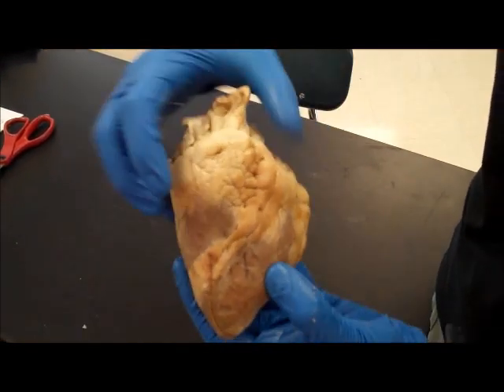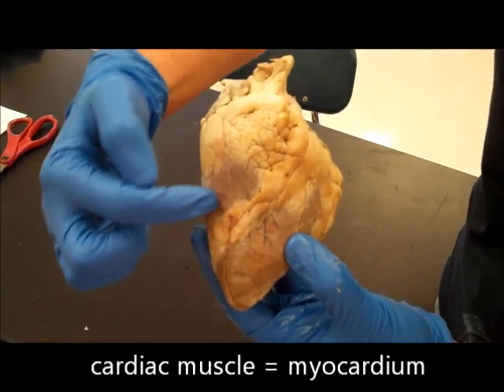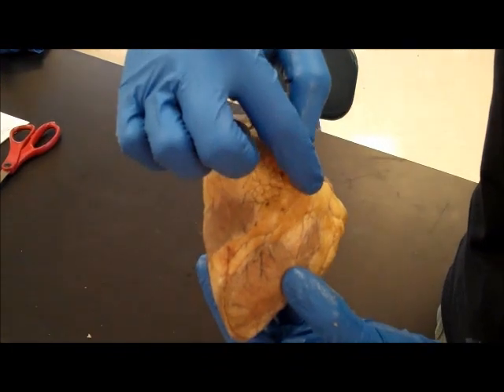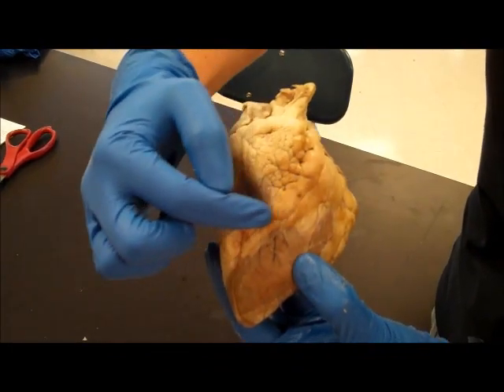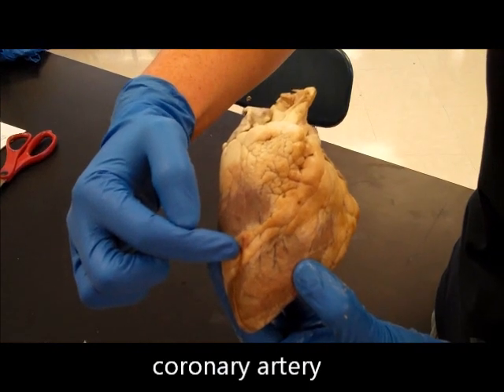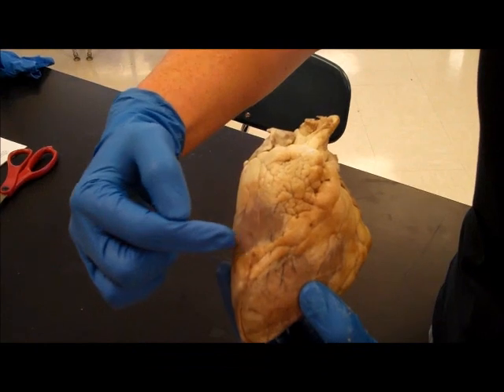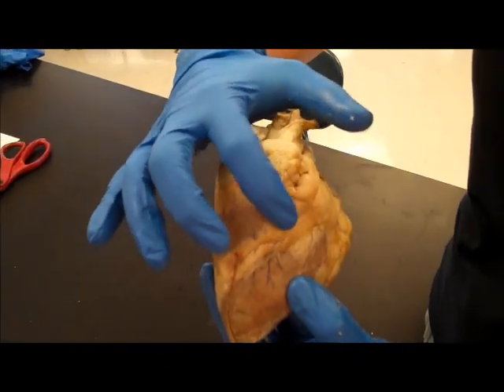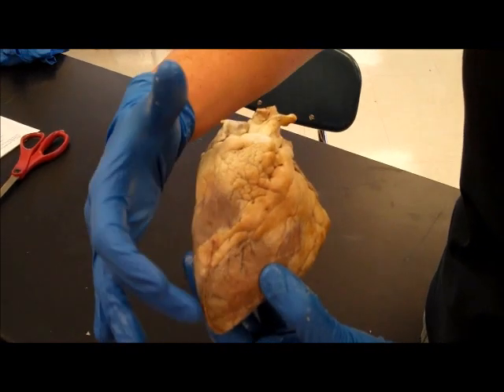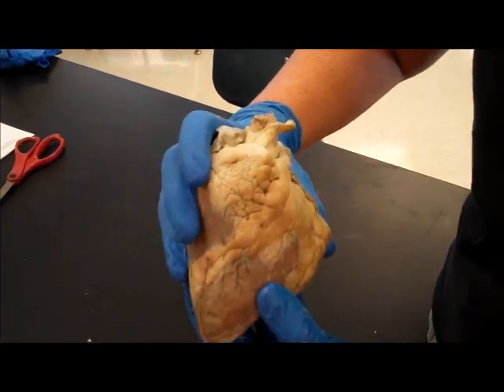You will see the brown here. This is cardiac muscle. This area right here that's covered by fat, underneath this runs the coronary artery, and there are additional arteries that then branch off of that coronary artery. And if you remember from your research, the coronary artery supplies the heart tissue with blood.